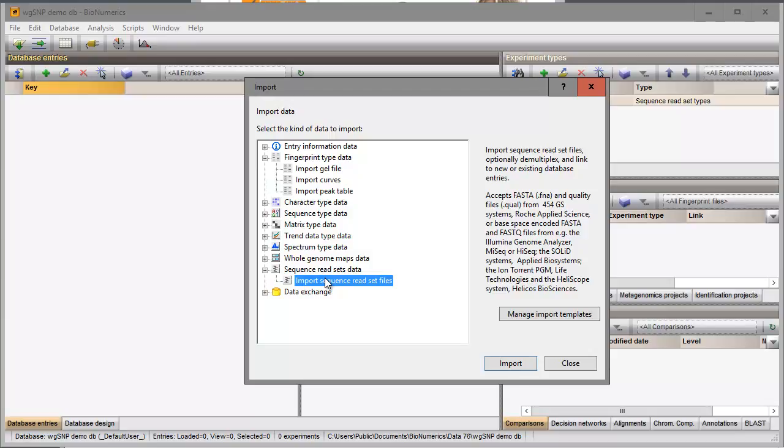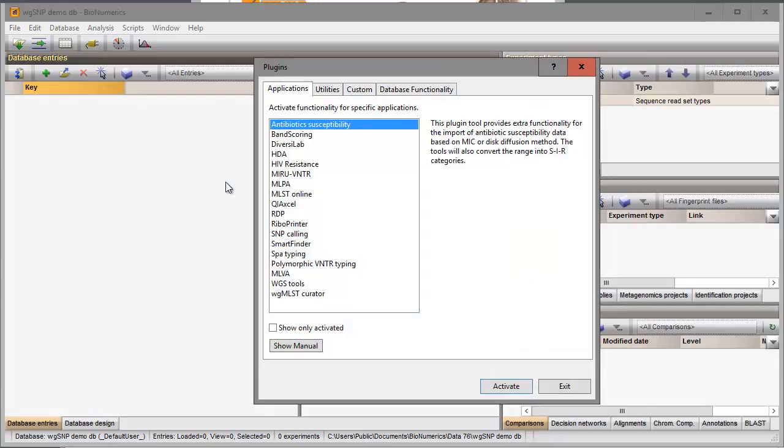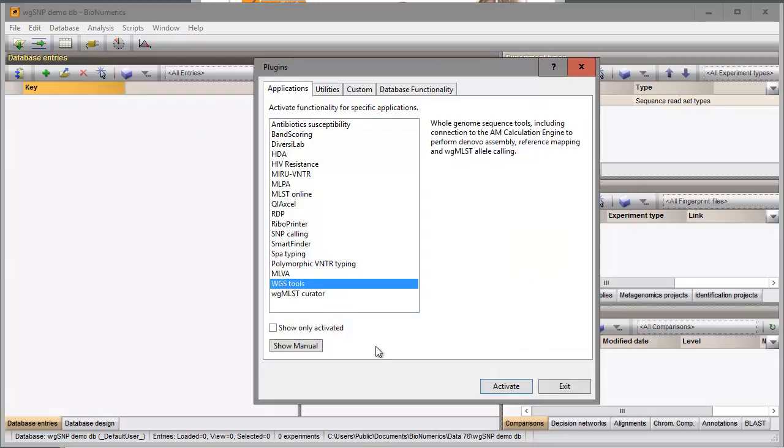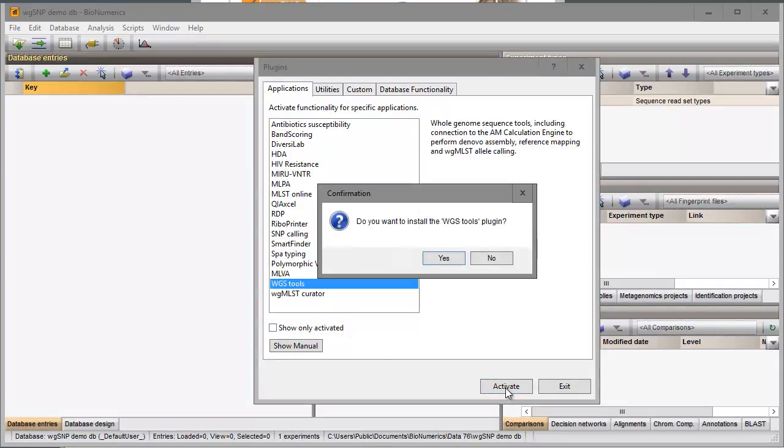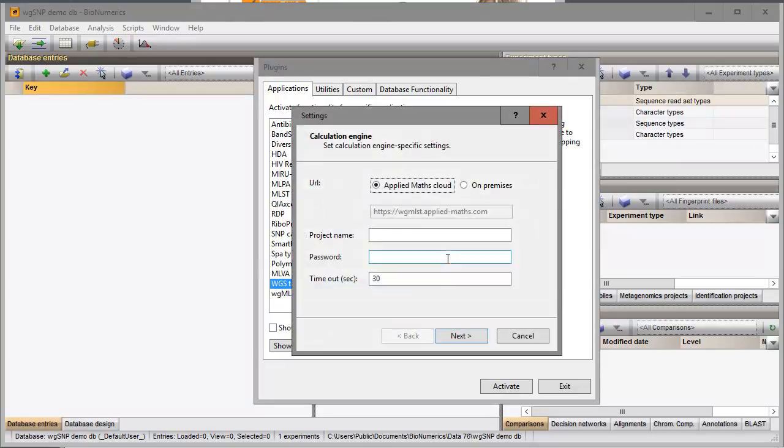I will close the Import dialog and go to the Plugin dialog to install this plugin. Installation of the plugin is only possible with a valid password and project name linked to a certain amount of credits.